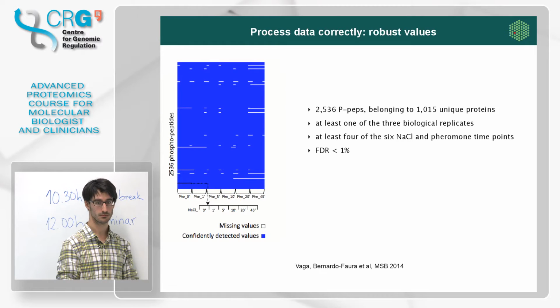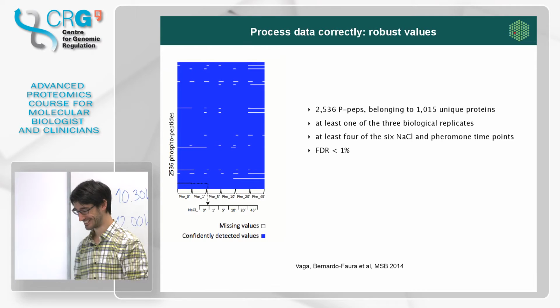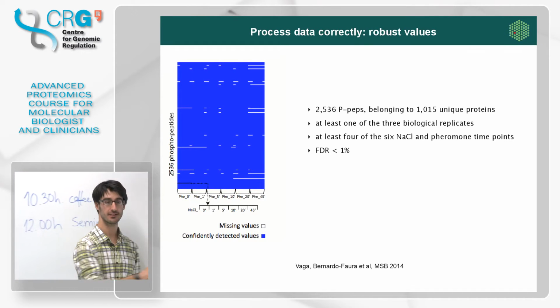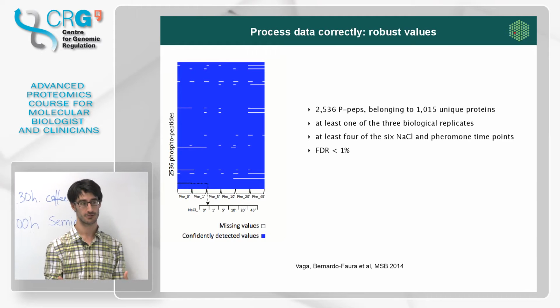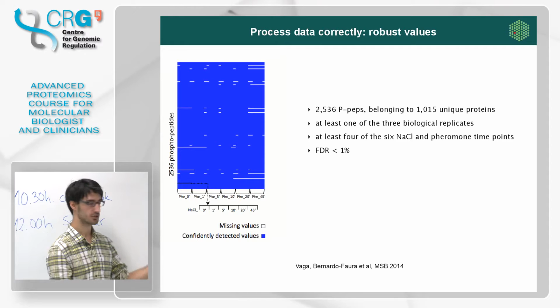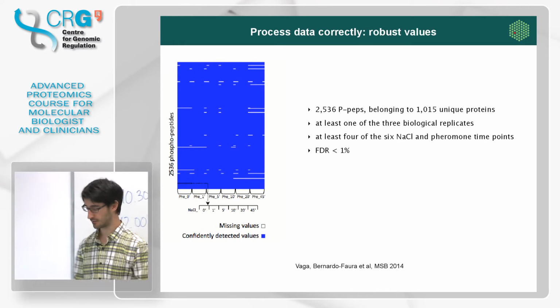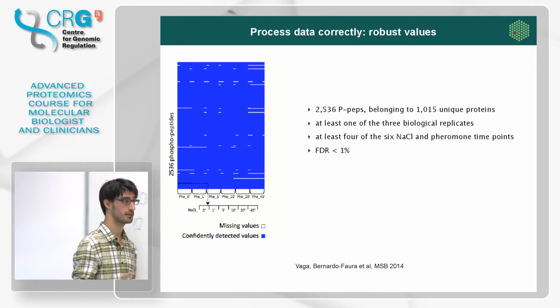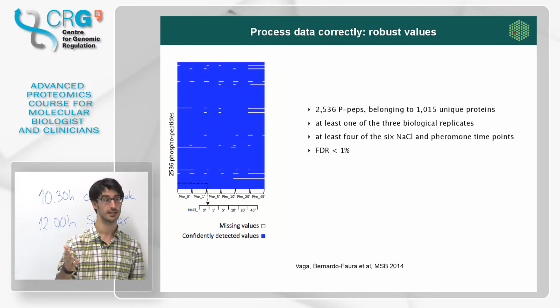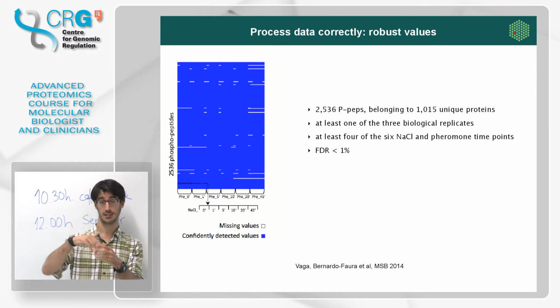We have the slides in front of us, so we know you have to normalize. Damn it. Cool. So what we just did dealt with the fact that we had some missing values, but didn't touch at all these actual values. So now it's time to see if we can compare them. What I showed you in my presentation yesterday is that if you just display the raw data, because of the dynamic range, the data is going to be all over the place.